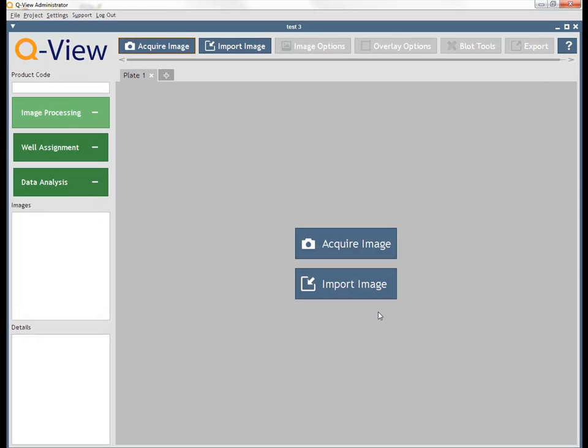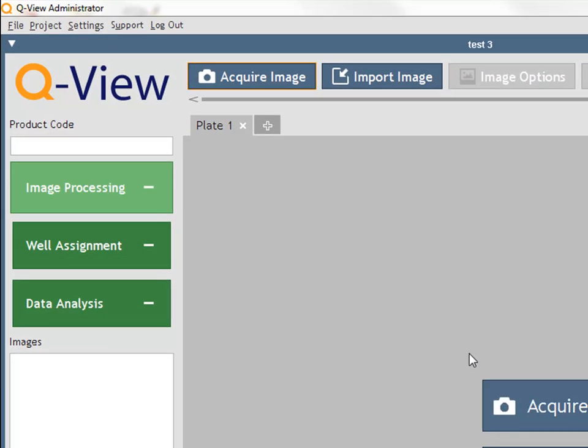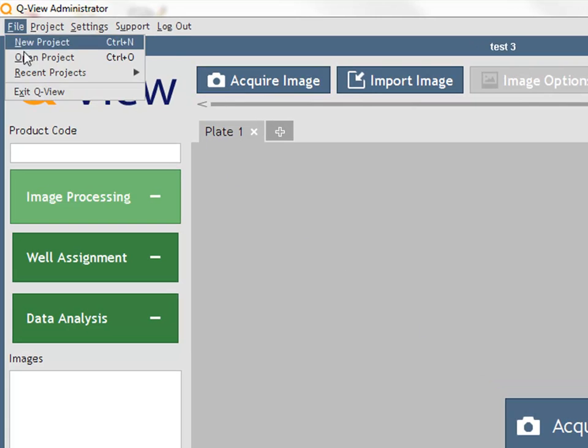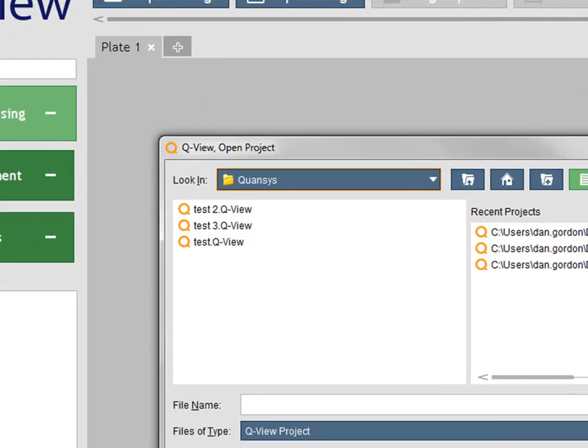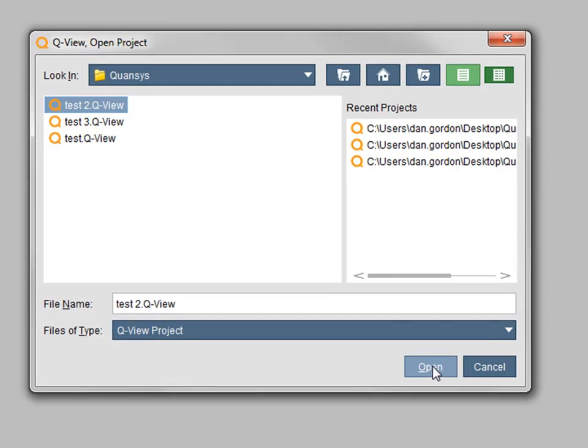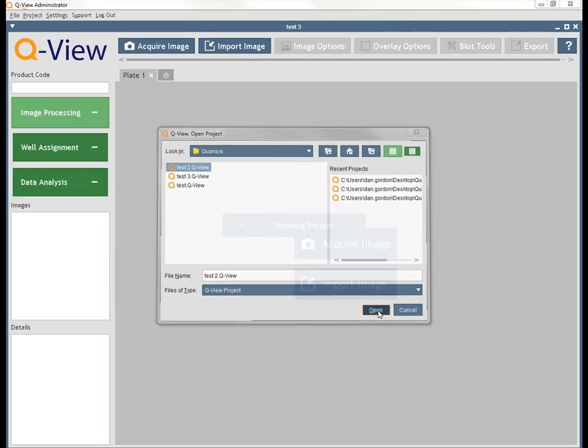To open an existing QView project, click File Open Project. A window will appear that allows you to navigate to and select the project. Click the Open button and the project will appear in QView.